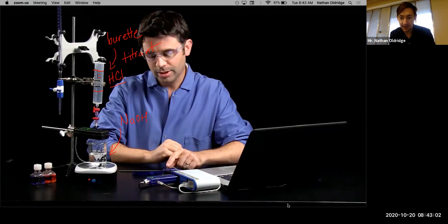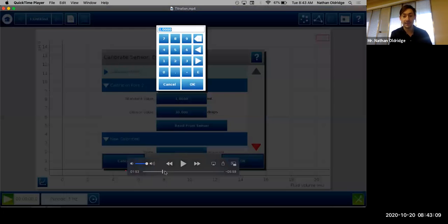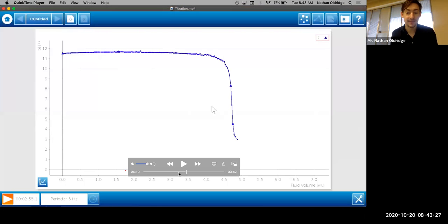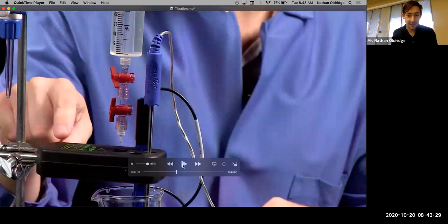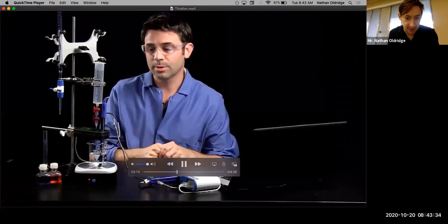I'm going to clear what I have here and fast forward through this guy. So he's going on and on about all the equipment that he's got. He's got some special software. He's actually even got something called a drop counter. He's calibrated it to the size of drops to expect out of this stopcock. And that way he can just count the number of drops and know exactly how many milliliters he's put in. That thing is expensive.